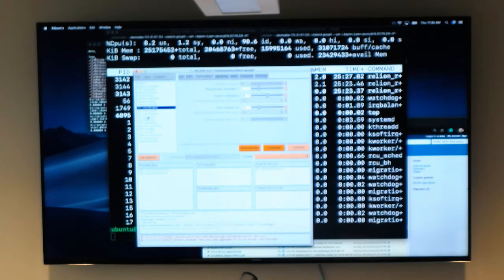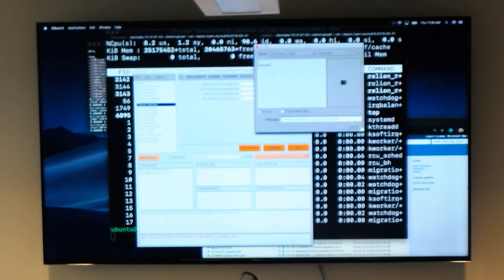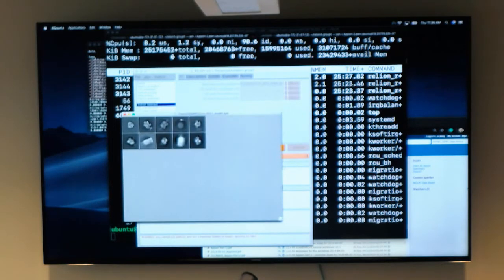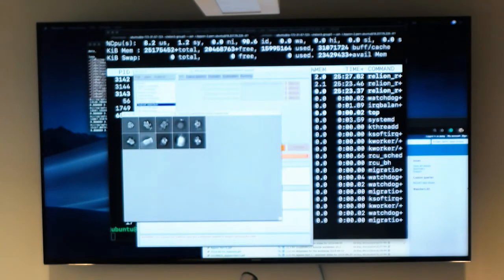Or I can say, I like it. I'm going to just go, and I feel so bold to say that even though it's not finished, I'm going to use this classification to sort particles. And I'm going to just display them. And I'm going to select what I like. Okay, this is tiny, so let me expand the display a little bit larger.